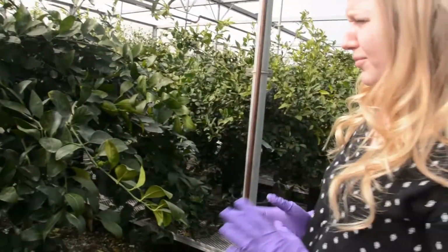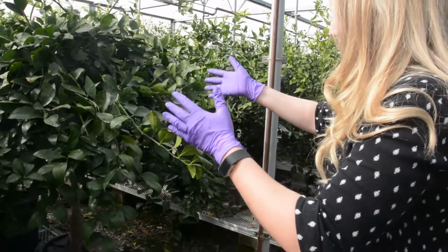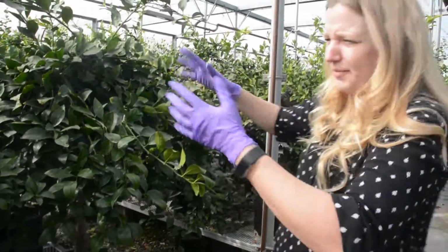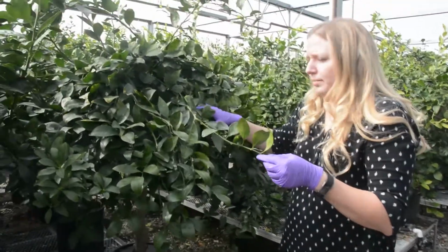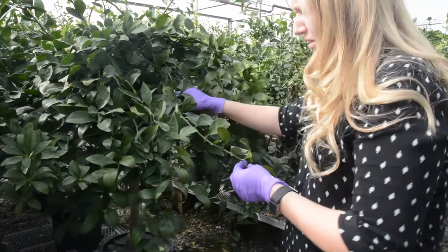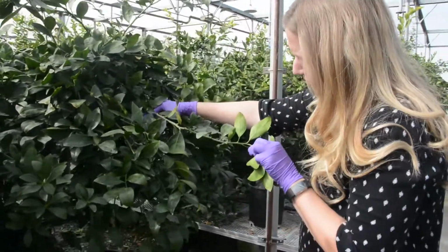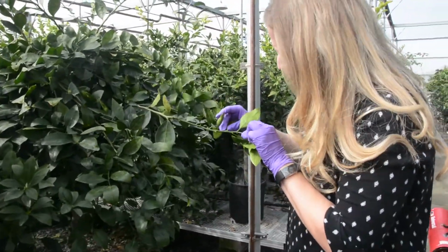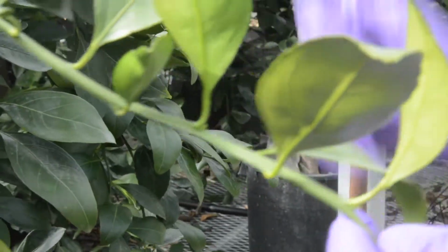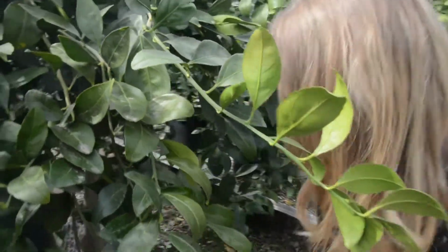We do trim these trees back once a year, about in March and April. So this is basically one year, however many months, of growth right here. They're almost due to be trimmed in the next couple of months. These buds right here did not quite push out. They are just starting to push out, but I'm going to show you what we do here to send these to Fort Collins for further processing.